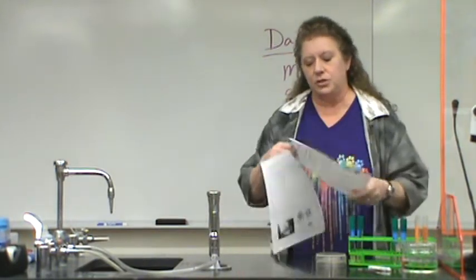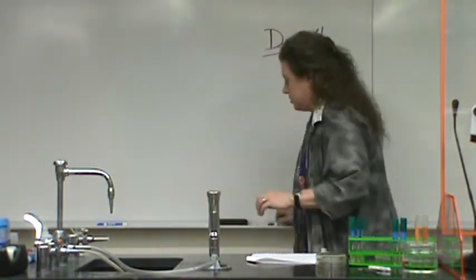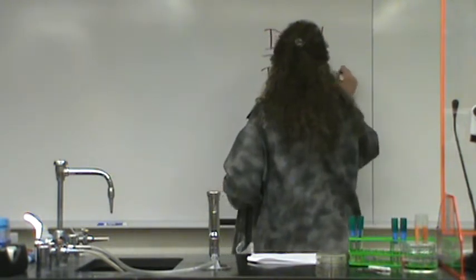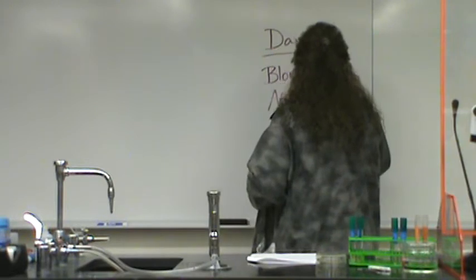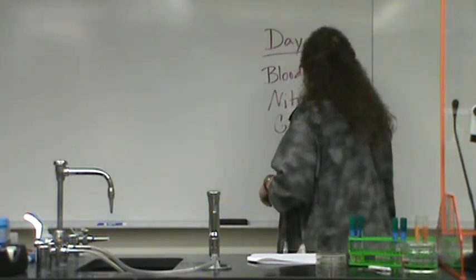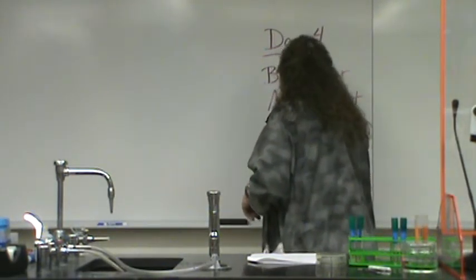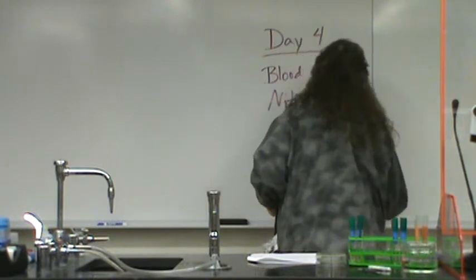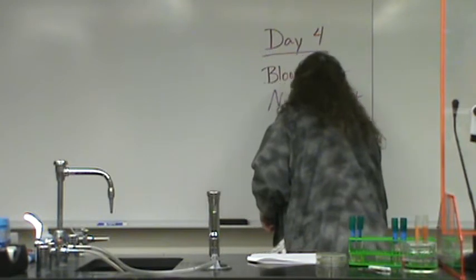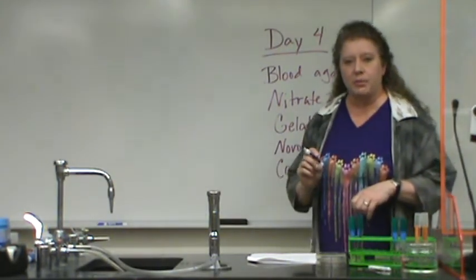On page 2 it tells you you are doing a blood agar plate, a nitrate test, a gelatin tube, a novobiocin test, and a coagulase test using a test by the brand name SureView.